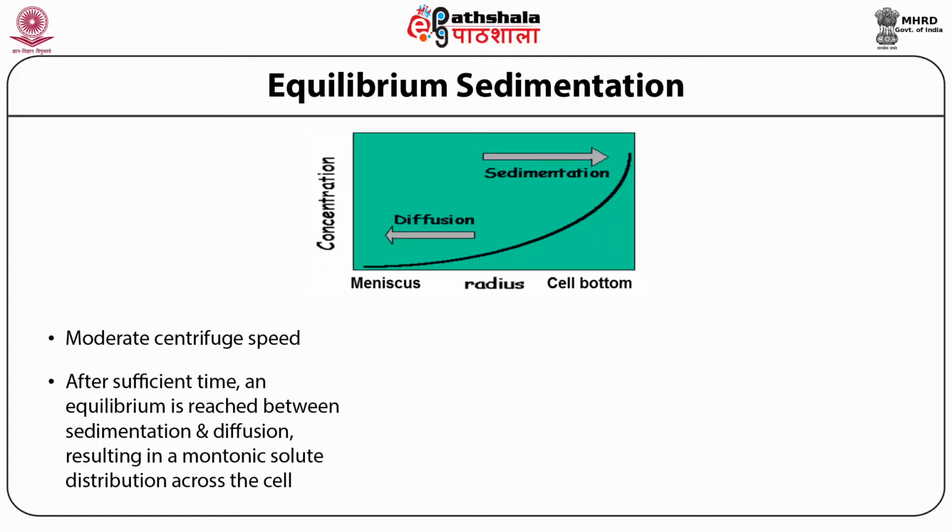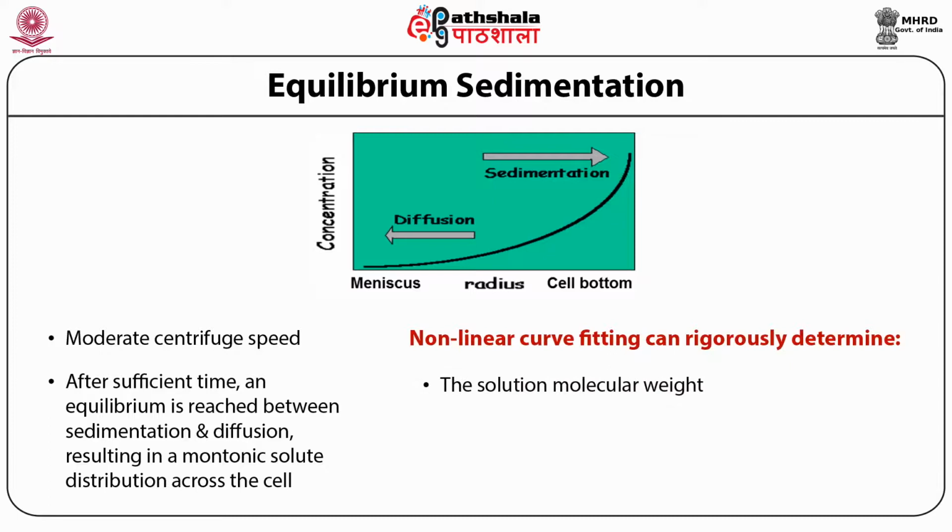However, in the case of sedimentation, non-linear curve fitting can regularly determine the solution molecular weight, the association state, and the equilibrium constant for the complex formation. That is the major feature of the ultracentrifugation technique.